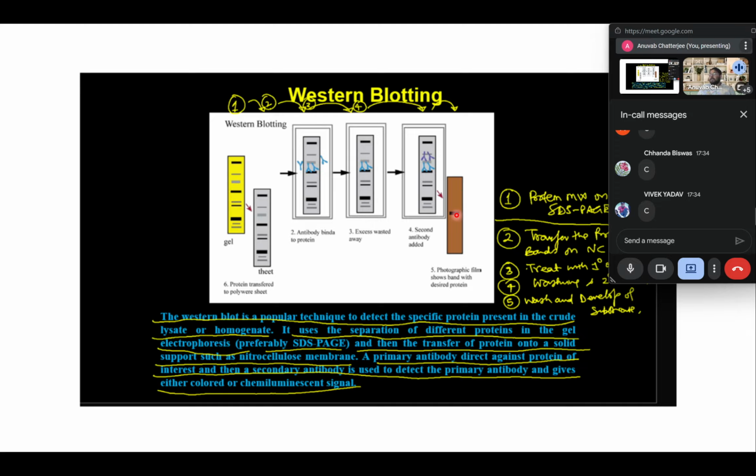The final thing that you can keep in mind is the probing mechanism with antibodies. Antibodies, as I said, are proteins which will bind to a specific region of a protein of interest. So if you have a protein A, it will bind to this 200 to 300 amino acids of protein A very specifically. But antibodies are very expensive in nature. So when you use an antibody, you cannot radiolabel it directly.